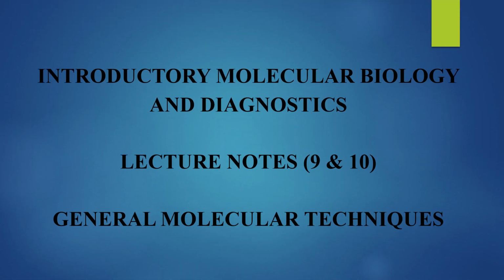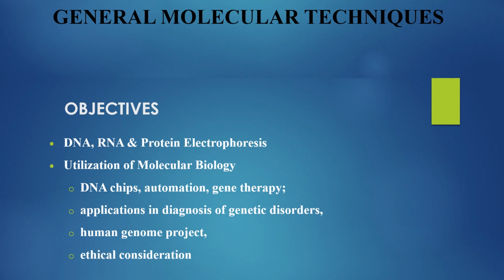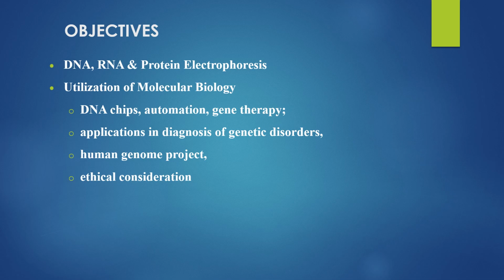Now, this is Introductory Molecular Biology and Diagnostics, our lectures 9 and 10. In this, we'll be talking about general molecular techniques. Now, the objectives for this section, we'll be looking at DNA, RNA, and protein electrophoresis. Then we'll talk about utilization of molecular biology in our daily activities as laboratory personnel.